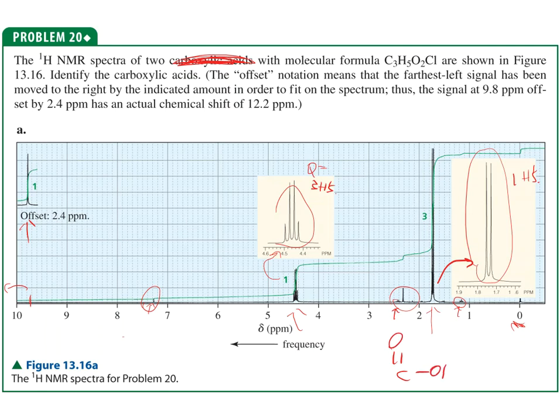So I'm going to get my carboxylic acid group, my carbon, and my carbon. So there we go. And then off of this is a chlorine, and we have a CH3 group and a CH group that is there. All right. The CH3 group, of course, is the one furthest away from the electronegative group, and that is going to be split into 2. It's a doublet.